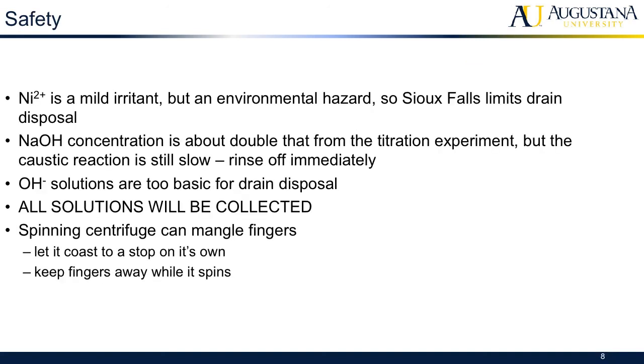Some words on safety. Nickel 2+ is a mild irritant. It's not super hazardous in the lab. However, it's an environmental hazard, so it cannot go down the drain. Also, you're adding base, and so you need to be aware that sodium hydroxide is hazardous, and you don't want to spill that on yourself or anywhere. And if you do, you need to notify the instructor or the laboratory assistant so that we can get it cleaned up and rinsed off quickly.